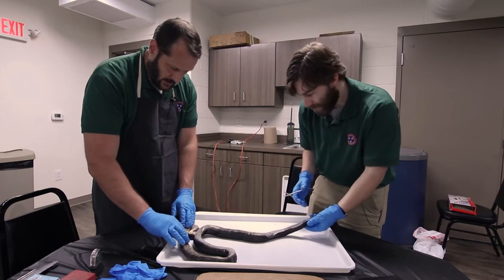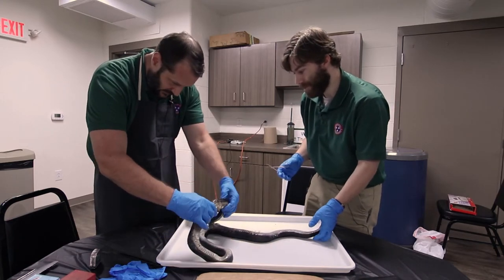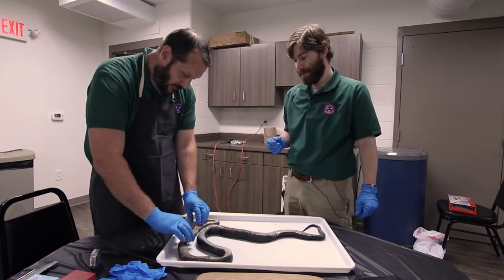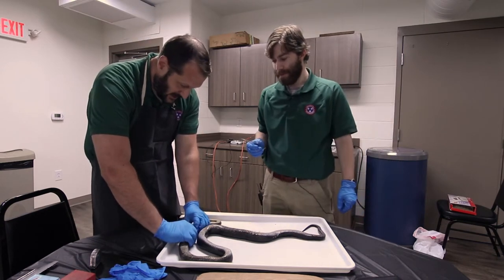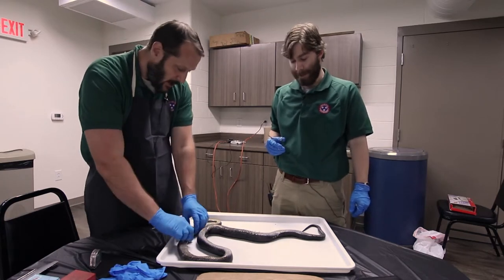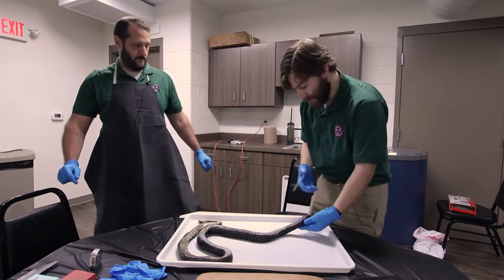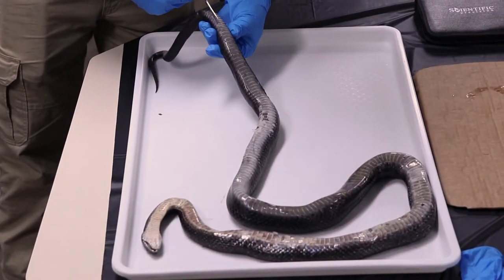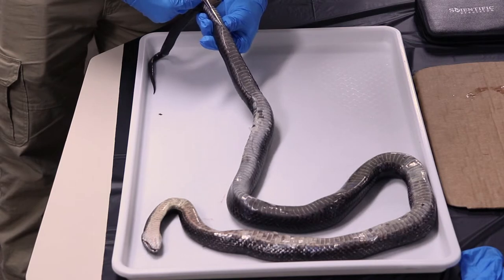Now let me guess here and say it looks like this animal might have been run over in this region here. So unfortunately, that's going to obscure some of our soft anatomy in this thoracic region. I'll be curious to see what we find in there. Also, while I'm cutting it open, I want to try not to pierce any of the organs, cut only the skin.